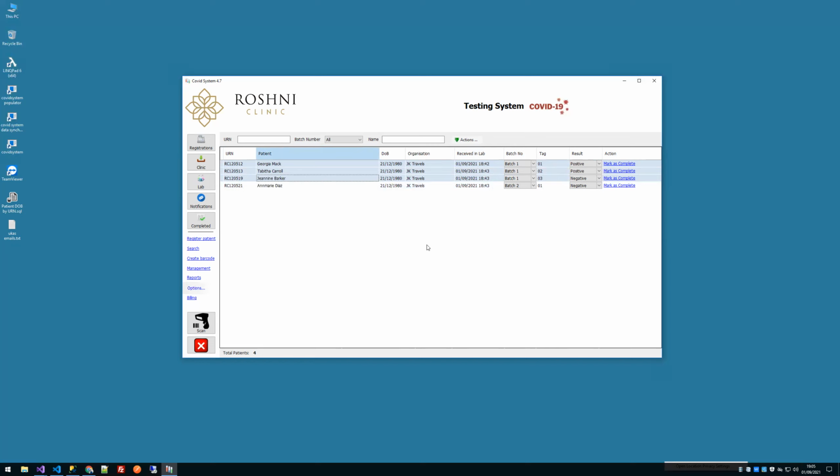So that step around putting into the machine and assigning it a well number, so you know what's what, so it correlates to what you have in the system, and the results, which most of the time are negative, and on a few occasions are inconclusive, indeterminate, or obviously positive, you can mark those individual items. That's easier. The easiest option is to mark it that way. Okay. So it's batch processing, and then you've got your individual positive and inconclusive in that case if you wanted to.